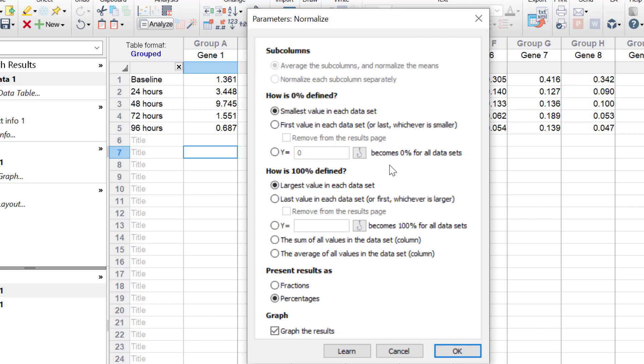So essentially, the aim of normalisation in this example is to take each gene's data separately and normalise the gene expression data so that the lowest value is 0% and the largest gene expression value is 100%. Then the values in between these two extremes are normalised accordingly.